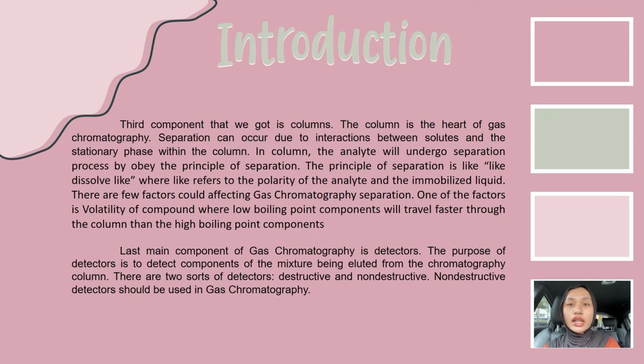There are few factors that could affect gas chromatography separation. One of the factor is volatility of compound, where low boiling point components will travel faster through the column than the high boiling point components.